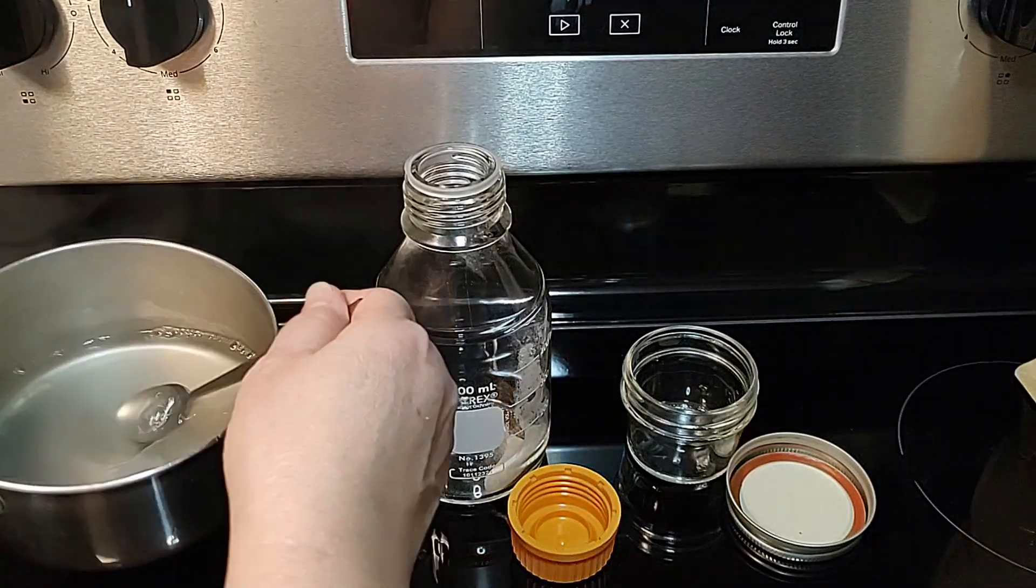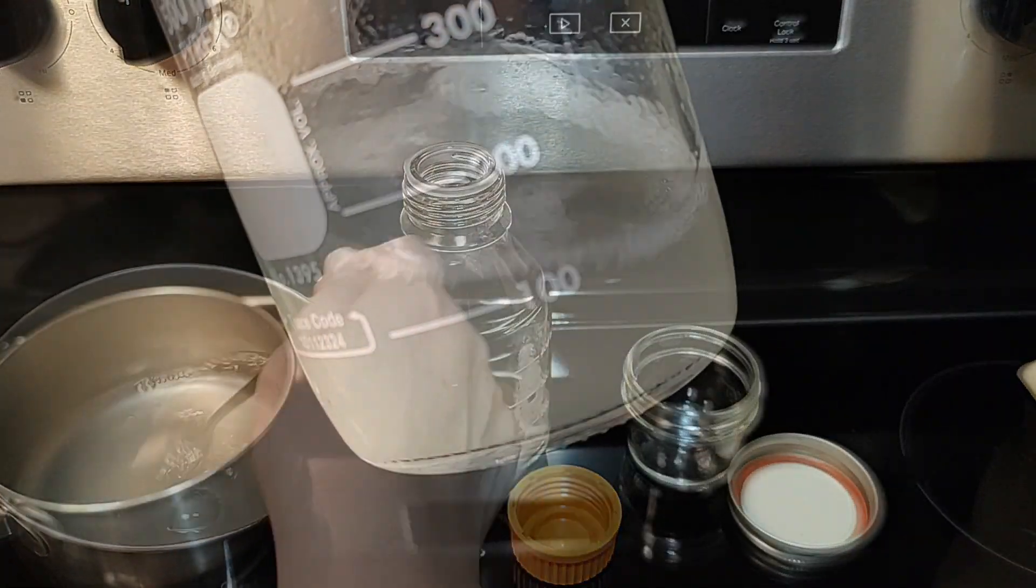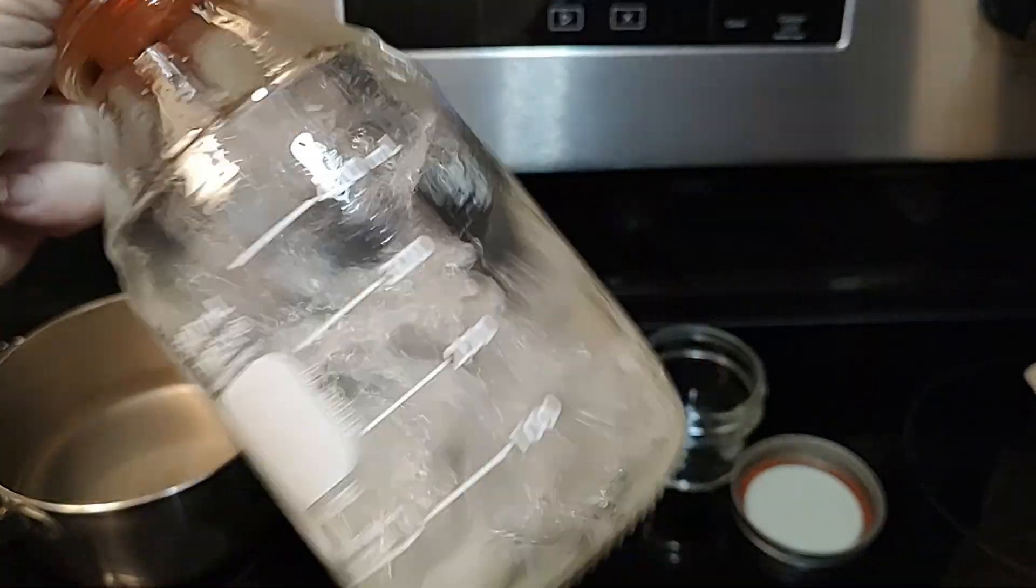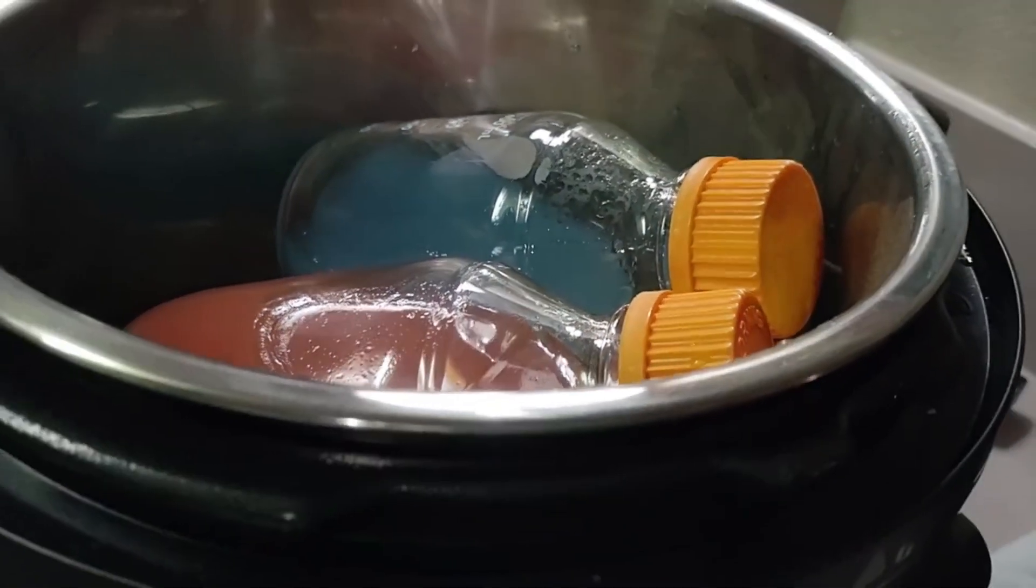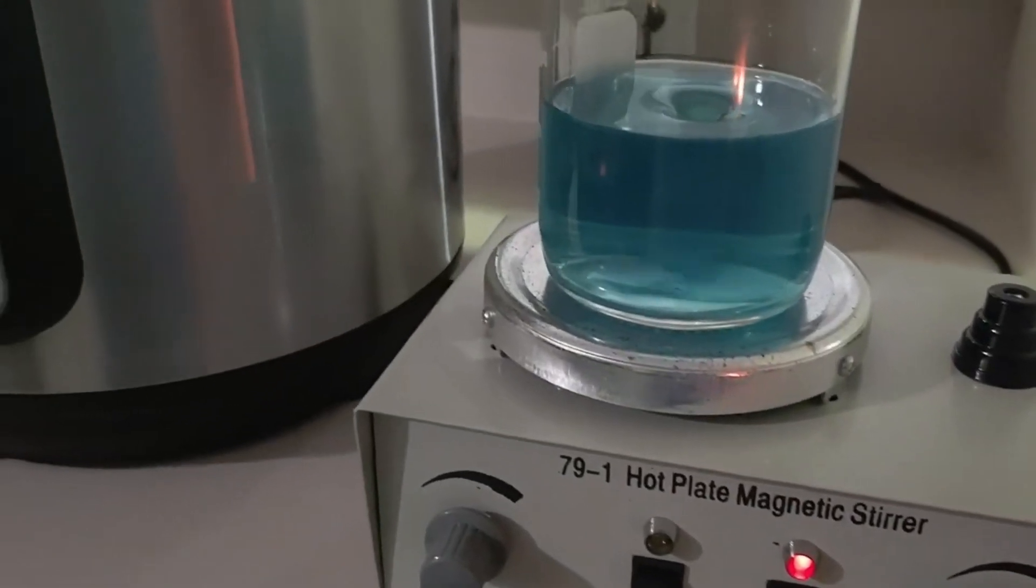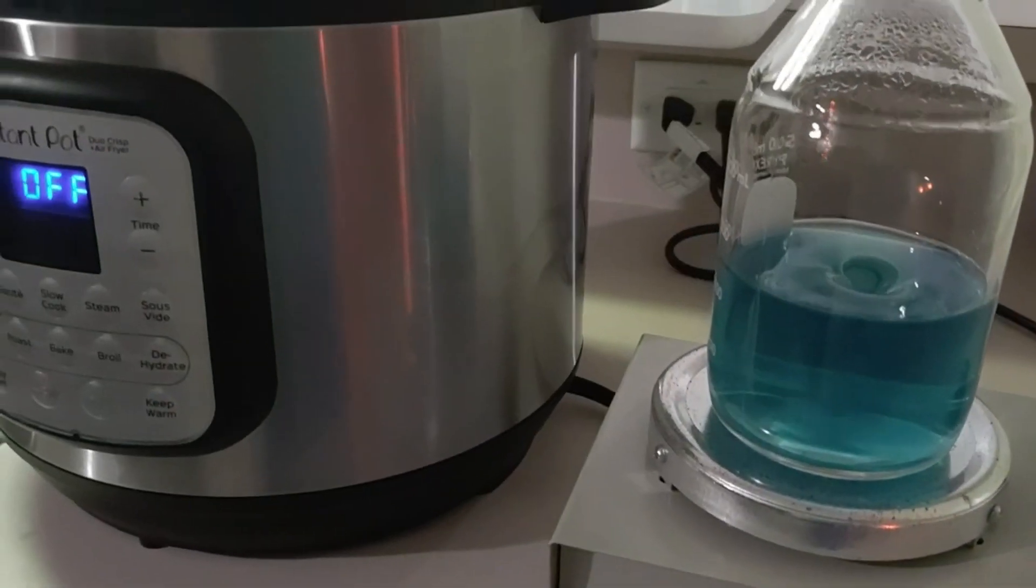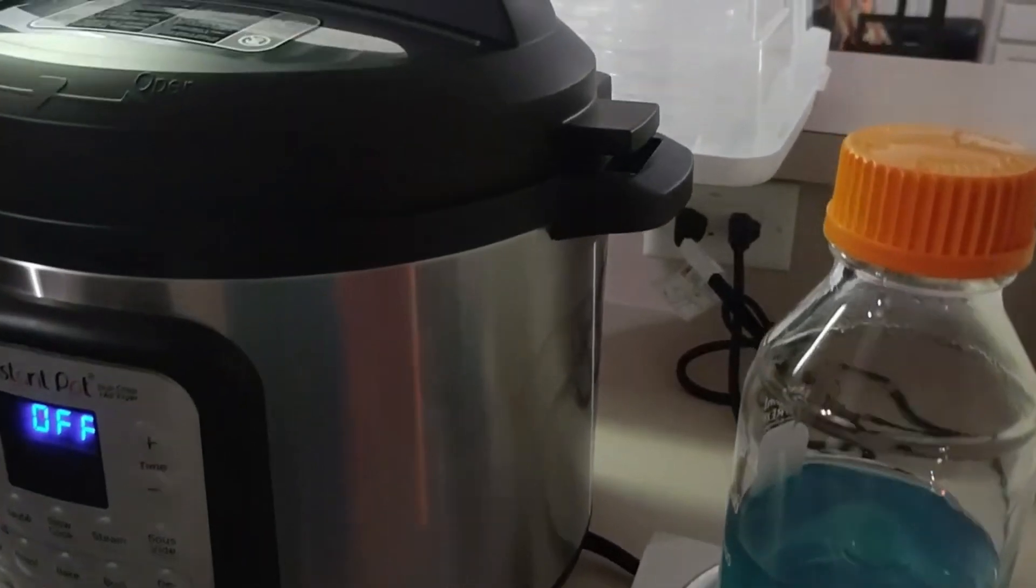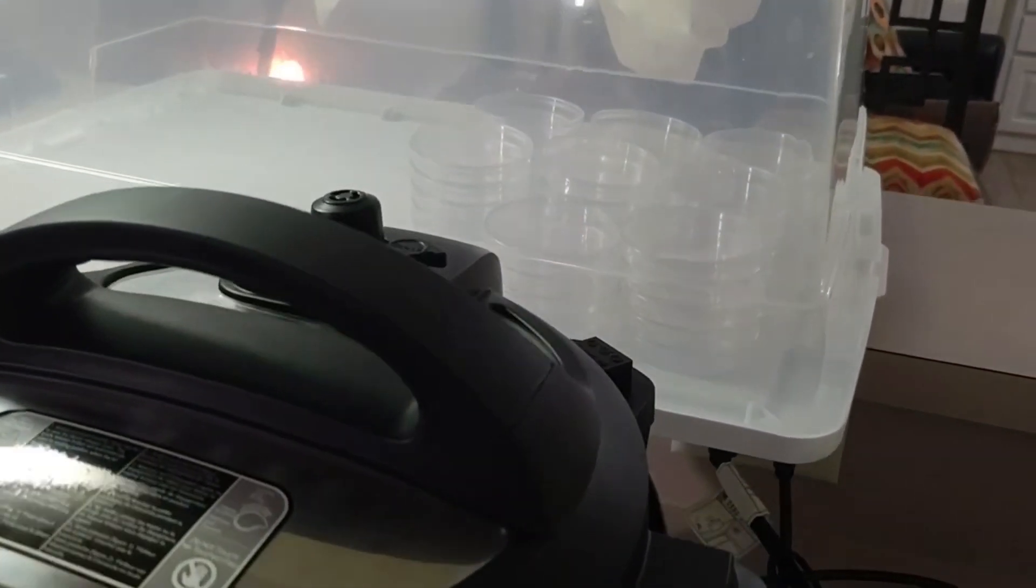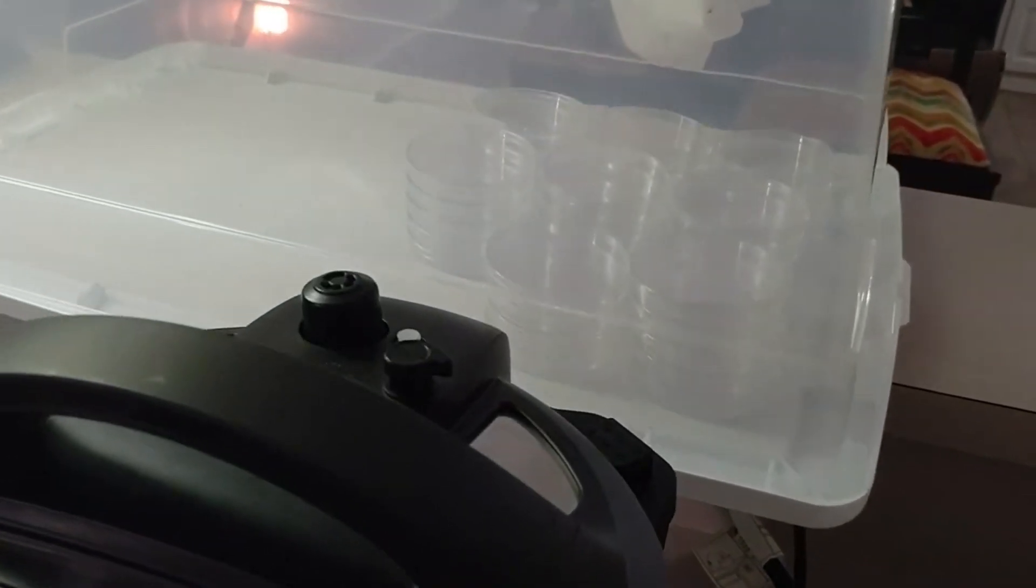Once you have allowed the agar to completely dissolve without clumping, then you're ready to sterilize in the pressure cooker. You will want to pressure cook for 20 minutes at 15 psi, then allow the bottles to cool between 140 and 120 degrees before pouring your dishes. We allow our bottles to cool while stirring on the magnetic plate with the heat off and monitor it with the temperature gun.